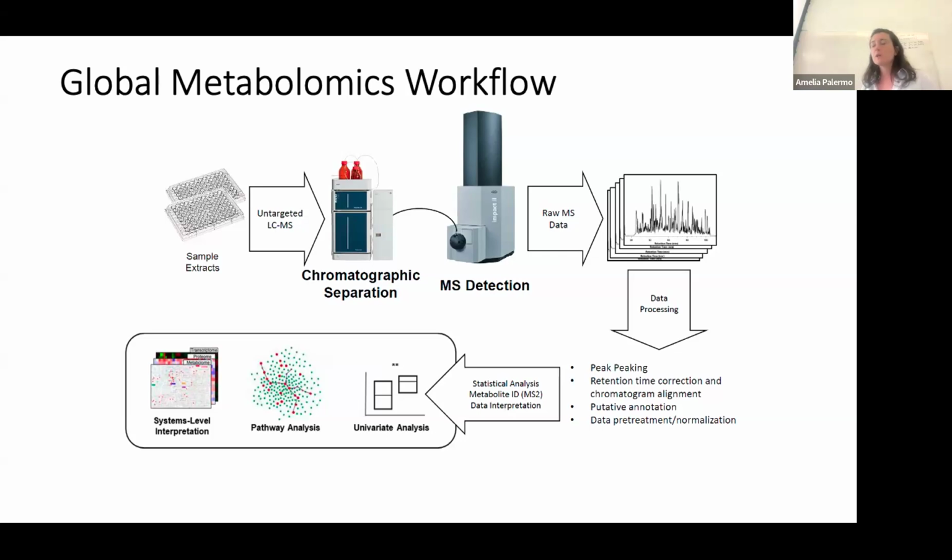The caveat here is that the more coverage you have, the more molecules you have on injecting your mass spec. Even if you have chromatographic separation that helps you separate and inject analytes at different times in the mass spec, the less specific your sample prep is, the more molecules you will have injected in the mass spec at the same time.